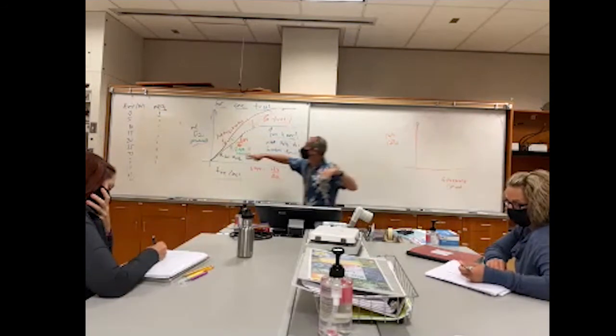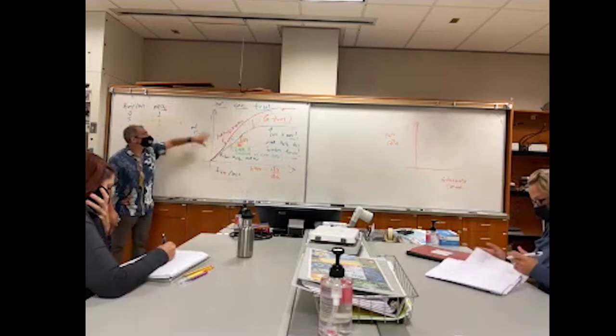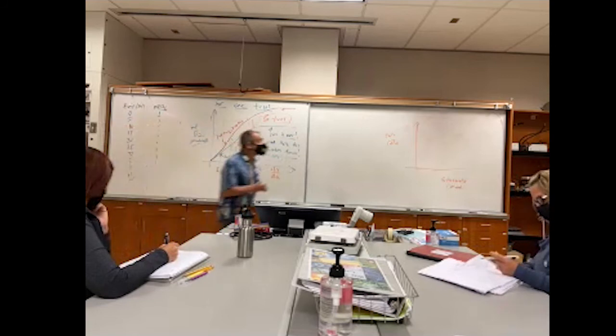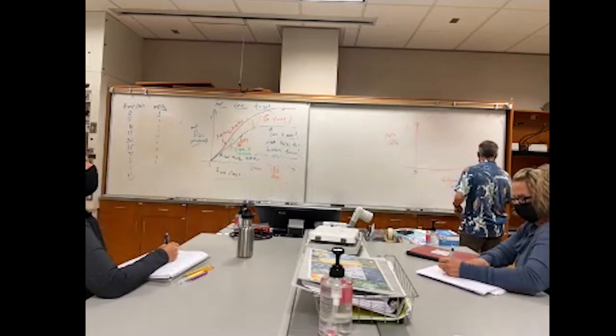The first step is going to be doing these things where you look at time versus oxygen for each of the 6 different trials, which are 6 different concentrations. For each of those concentrations, we're going to start from 0 substrate concentration to 100%.